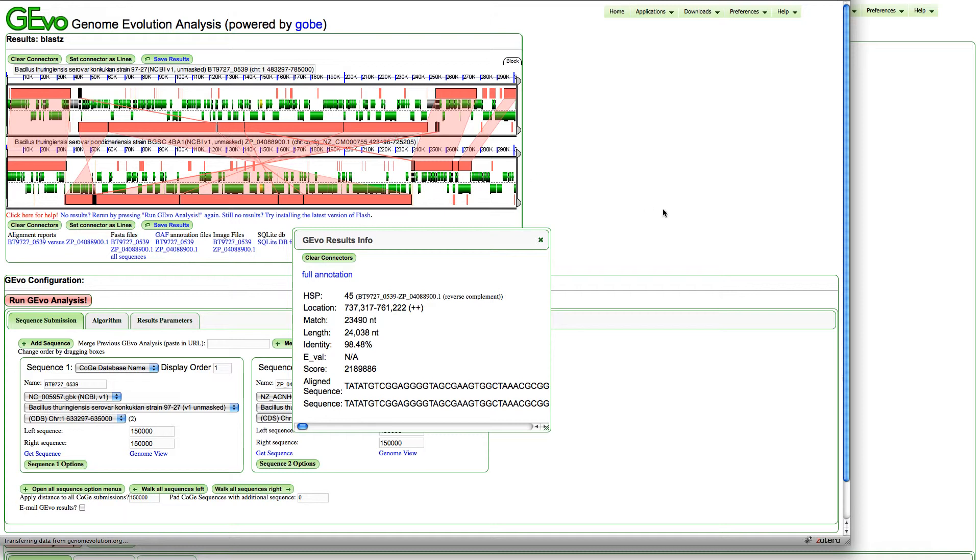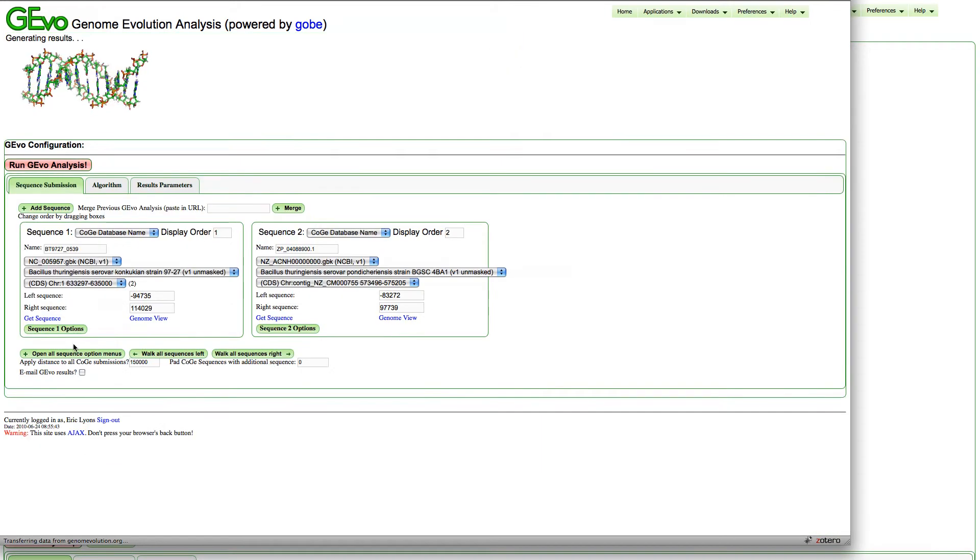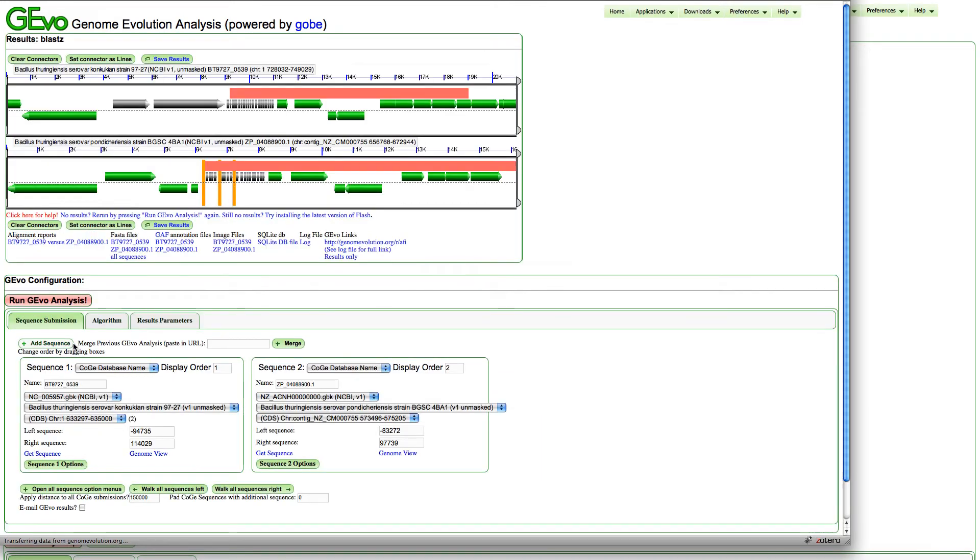I want to zoom in on these on both strands and look at them in more detail. I can use these slider bars to hone in on a particular region. I'll do that for both of them. To rerun the analysis, just press run GEvo. Here are those two regions.